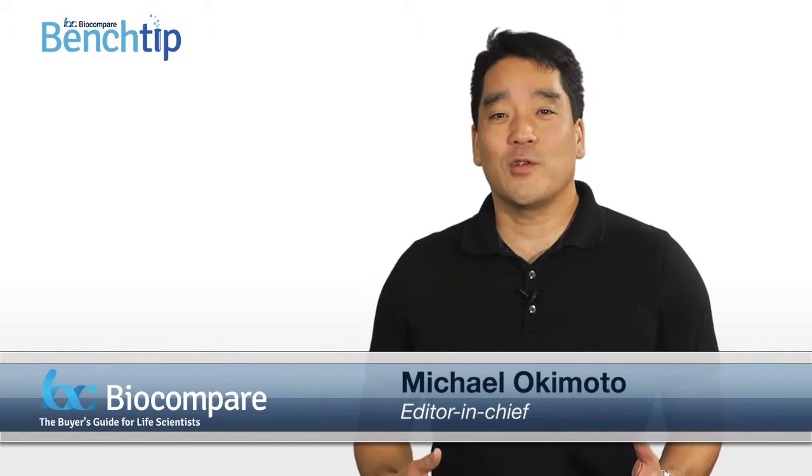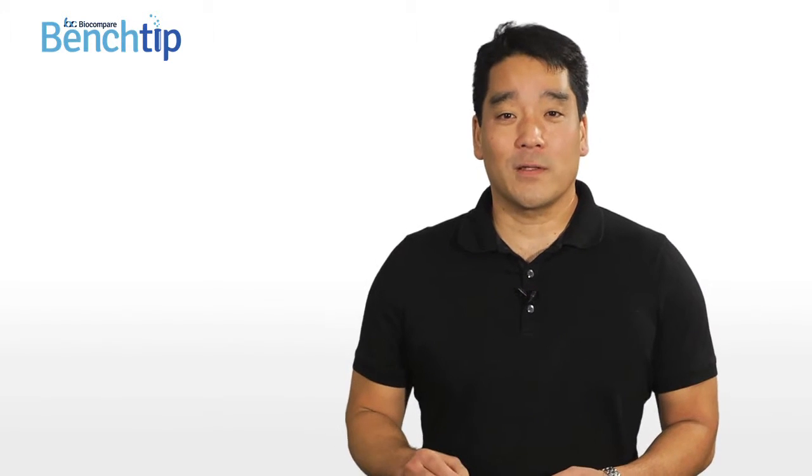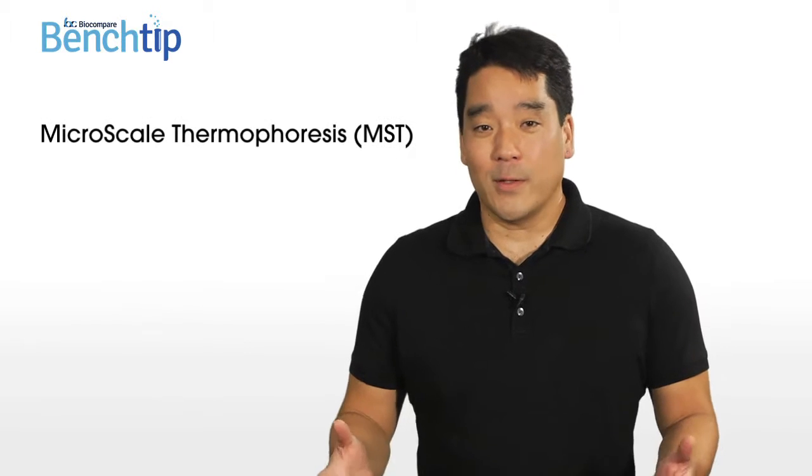Our video bench tips are a chance for us to talk about new developments and the tools and technologies available to life science researchers. Today, we're going to be focusing on microscale thermophoresis, or MST for short.